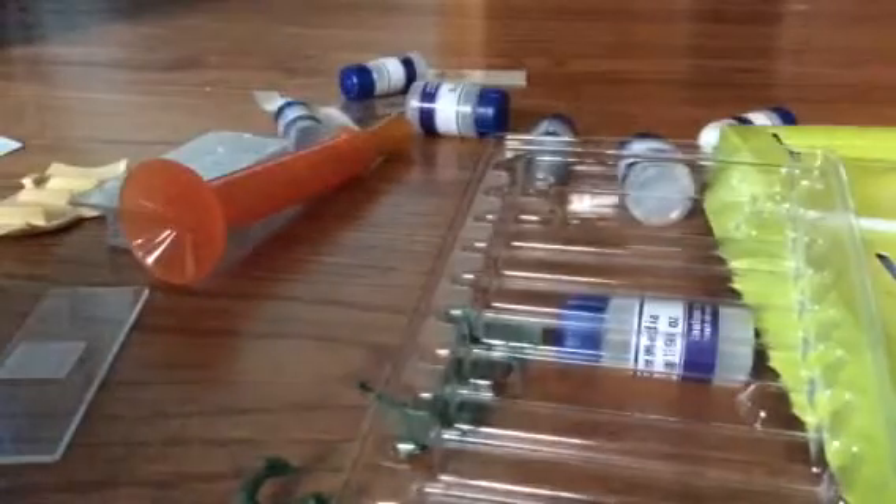Now, if you want it to be like this, pressing with lights and everything. Remember this company and you can look it up. It's for ages 8 and over. It includes one micro-microscope, one eyedropper, one straw, one small beaker.